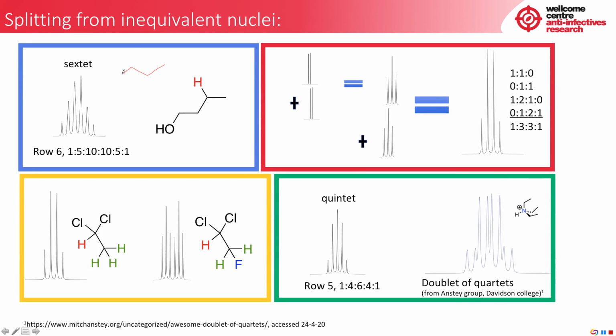that this is CH3 and that this is CH2, we have R. There's just no way you can actually make these equivalent. So I have got this particular signal simulated from butanol, and it's this proton here, and it couples twice there to give you a triplet, and 3 times here to give you a quartet. And this signal could also be considered a triplet of quartets where the J values are close enough that they overlap to give you this sextet.